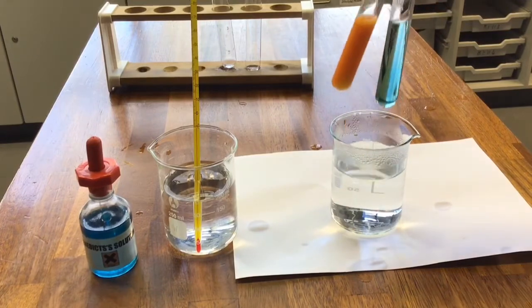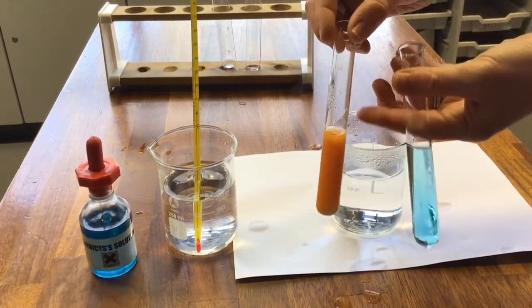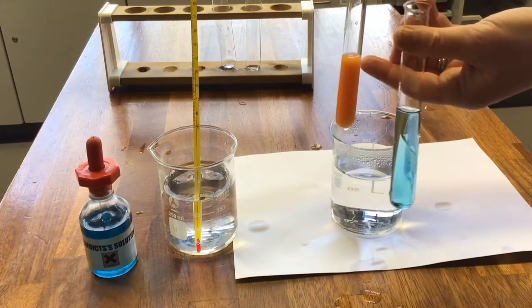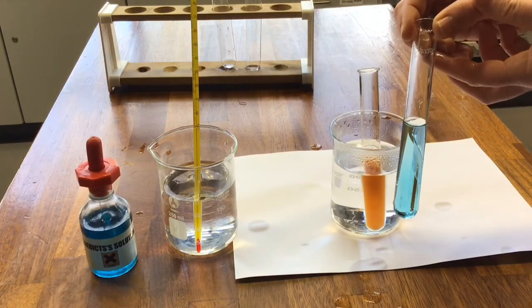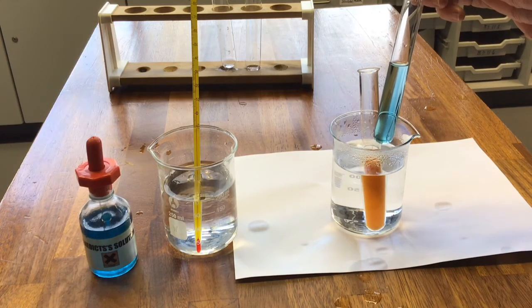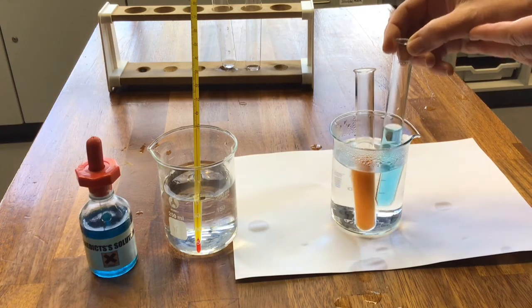So as the results, you can see with the normal saliva, the starch has been broken down to sugar. It has gone from blue to orange, dark orange, meaning that there's lots of sugar present. Whereas in the boiled saliva, it has stayed blue, meaning that the starch has not got broken down. And that is because boiling the saliva has destroyed the enzyme that would break down the starch, or we would say denatured the enzyme that breaks down the starch.